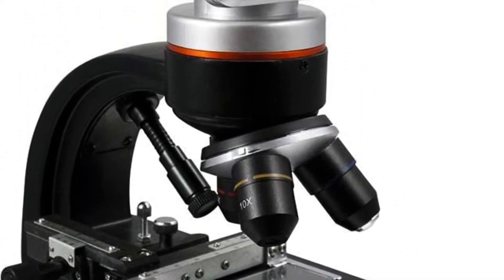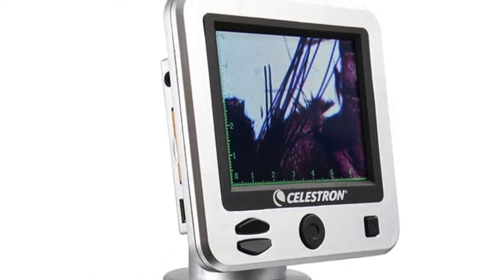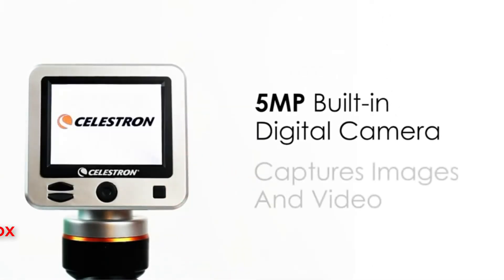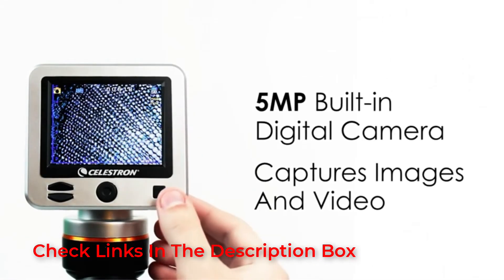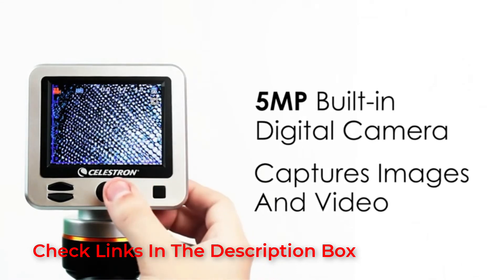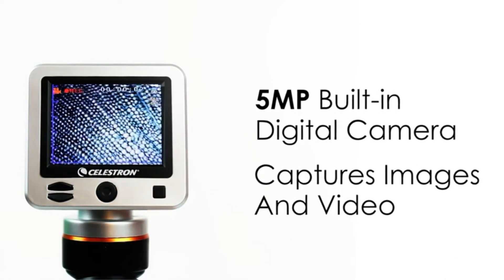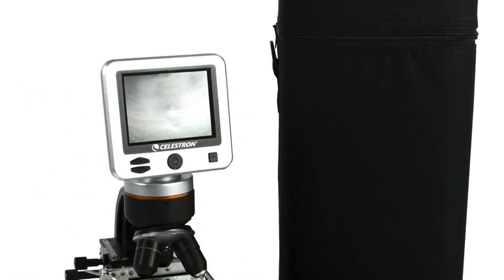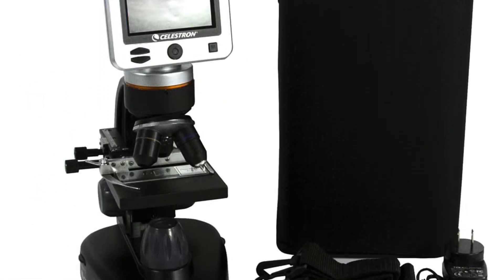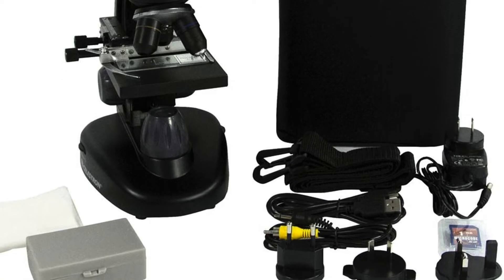This Celestron digital USB microscope comes at the third position of this list as it is the most powerful option mentioned here. While it may be quite powerful in terms of its magnification, you only get a tiny screen size of just 3.5 inches. Talking about its camera, you do get a decent 5MP camera in this digital USB microscope. Thanks to this camera and the high-quality optics used by it, it is able to offer a very high zoom range of up to 1600x to the user.